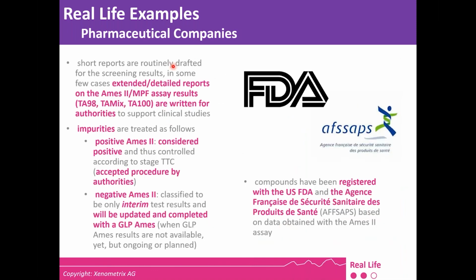Here I will just very briefly state that the pharmaceutical company that has been using the Ames MPF has registered compounds with the FDA, and has also registered compounds with the French agency, based on data obtained with the Ames2 assay.